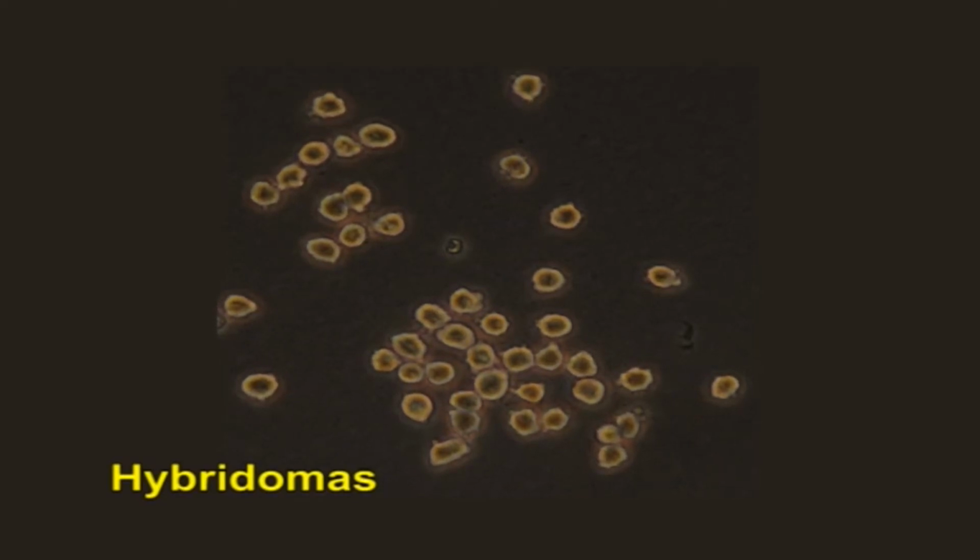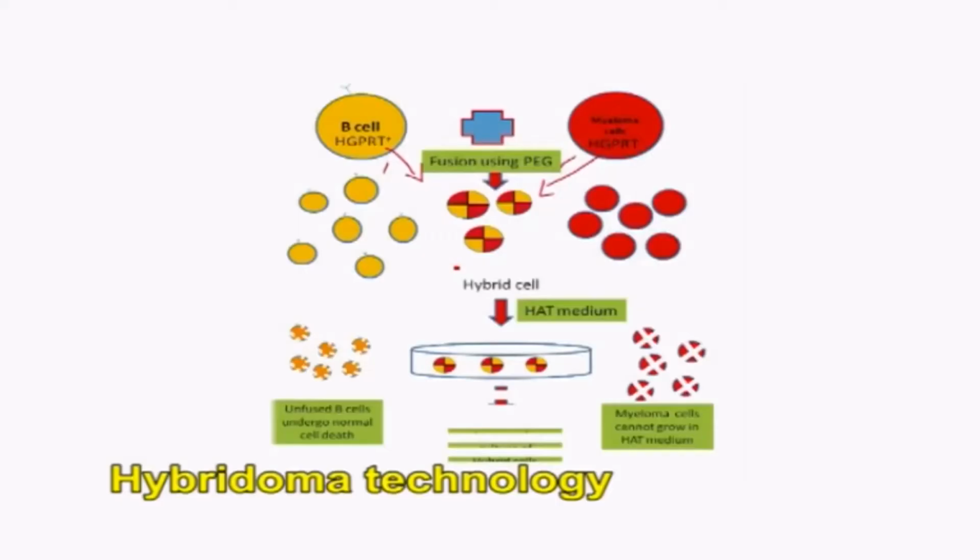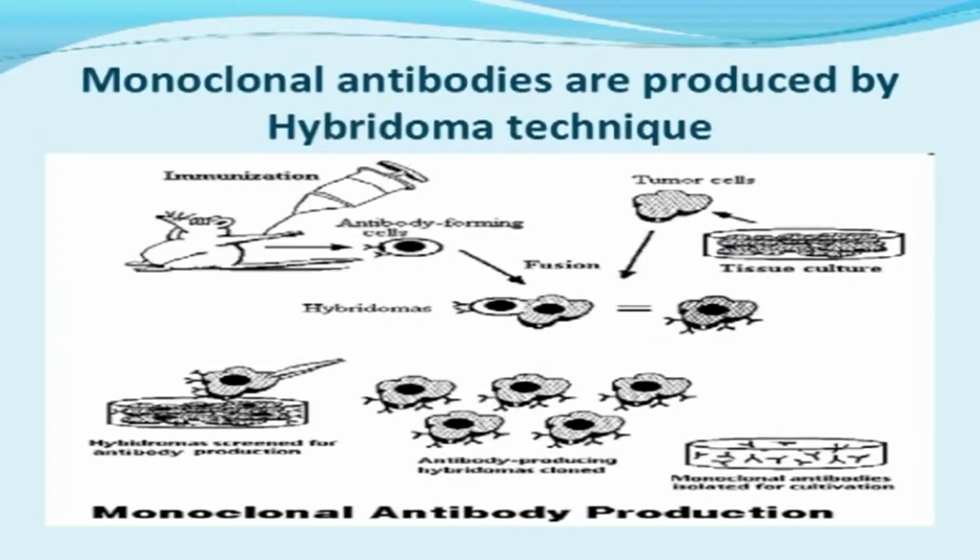To conclude, by going through this session, we got to know that hybridomas are cells that have been engineered to produce a desired antibody in large amounts, to produce monoclonal antibodies. By using a technique called hybridoma technology, monoclonal antibodies can be synthesized in specialized cells. To improve the production of monoclonal antibodies using hybridoma technology, considerable efforts have been made during the last 10 to 15 years. We also discussed the advantages and disadvantages of the monoclonal antibodies and the hybridoma technology. Many applications that are extremely useful were also discussed above.